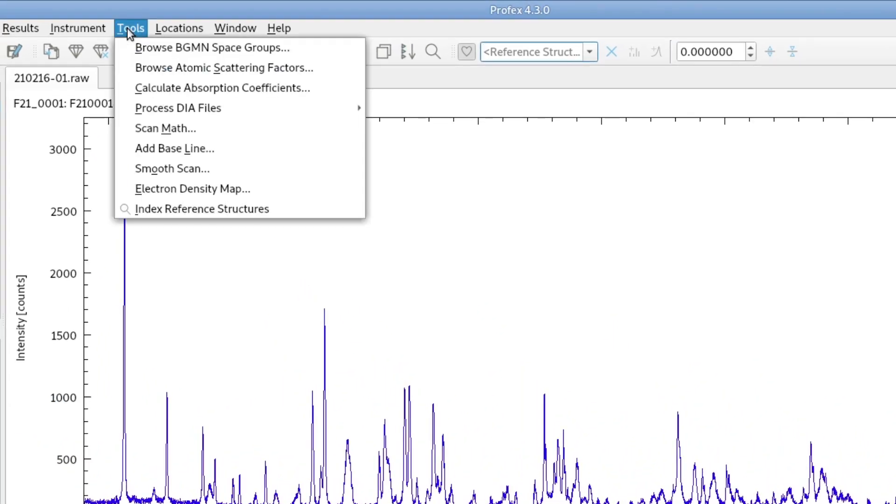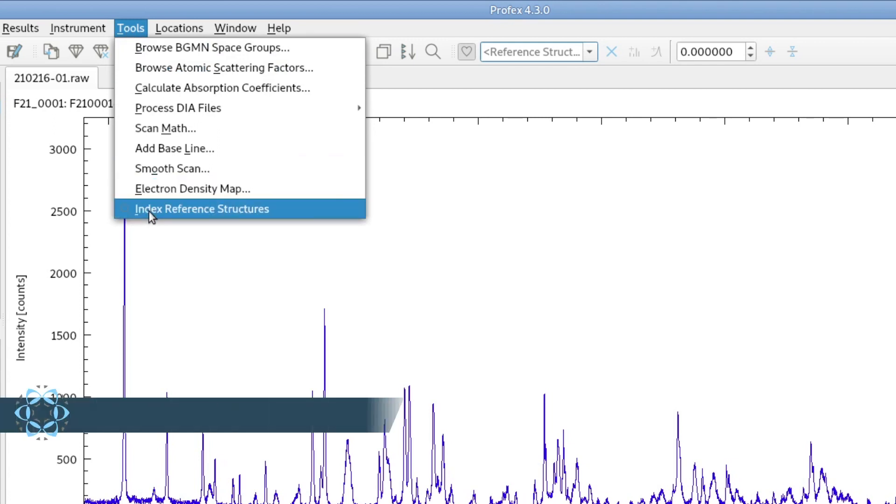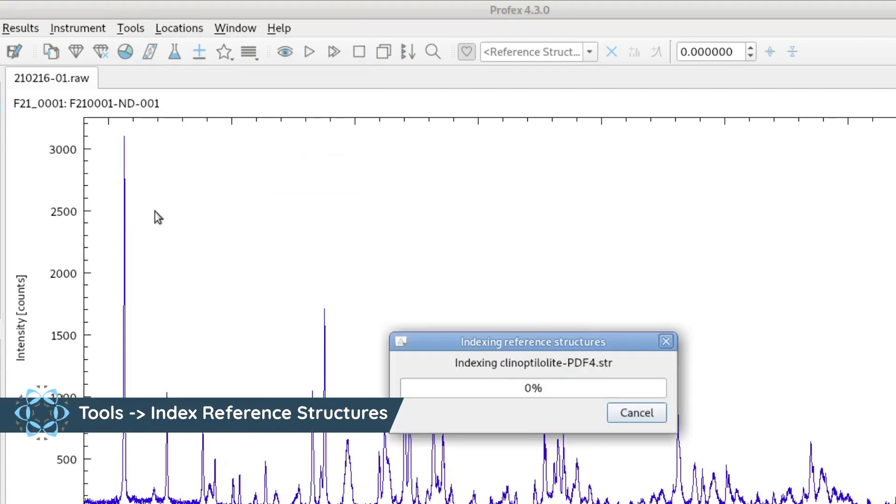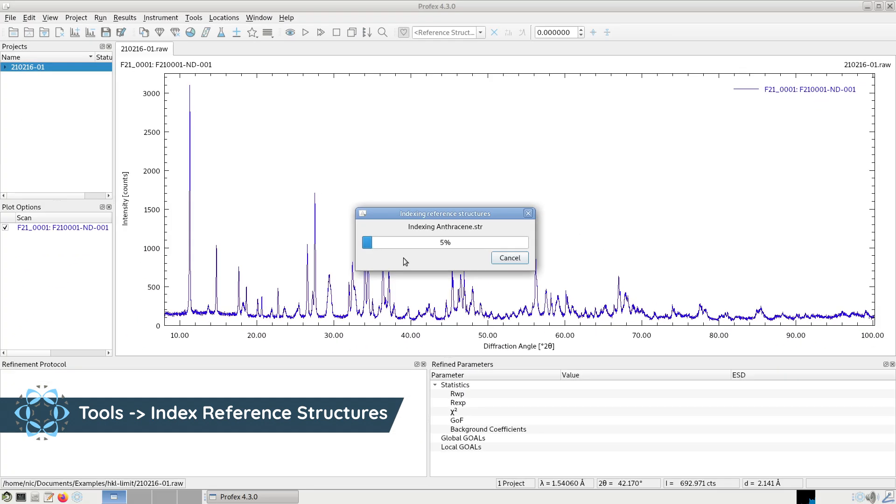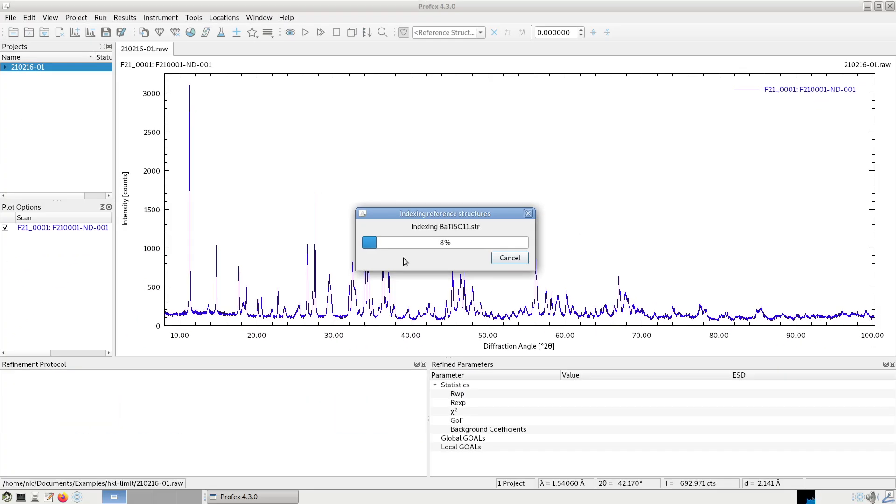And now we go to Tools, Index Reference Structures to re-index the whole internal structure database. It's going to take a bit longer if we set the angle to a higher value.